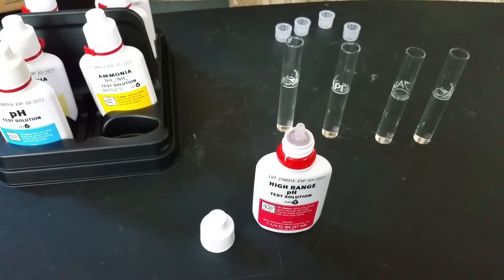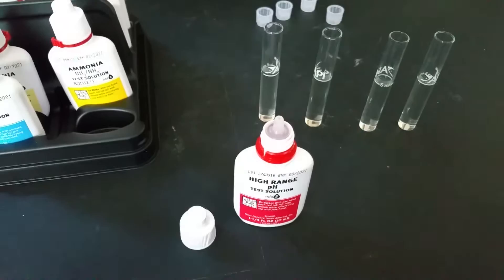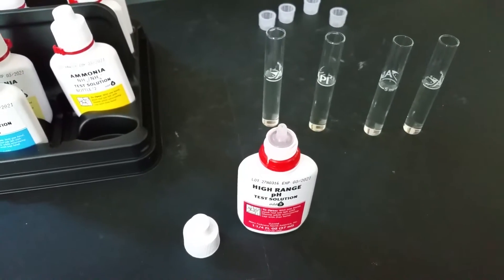Hey everyone, I'm going to show you all how to do a water test using the API Master Freshwater Test Kit.